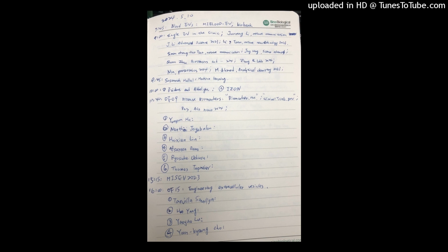Okay, good morning everyone. I'm Hui Xianlin from Southern Medical University in China. Today I'm so glad to be here to have 5 minutes to introduce our work: profiling of single vesicle surface proteins with droplet digital immunoPCR for multi-subpopulation EV counting towards cancer diagnosis.